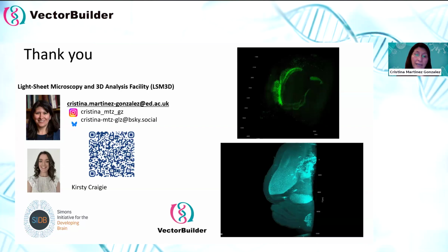Actually, it's used as a food additive, and it has the same refractive index of 1.56 as the final solvents. They will last at room temperature. So far, I can tell 8 years, because it's 8 years that we've been imaging these samples. It will last forever, literally forever. Water-based tissue doesn't; if you keep it in the solutions, they will disintegrate unless you bring them back to PBS.